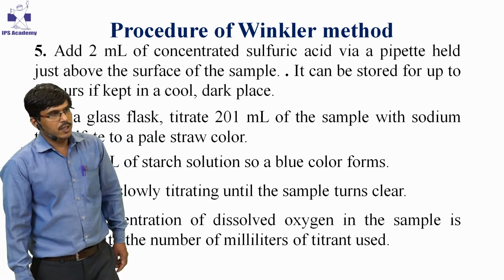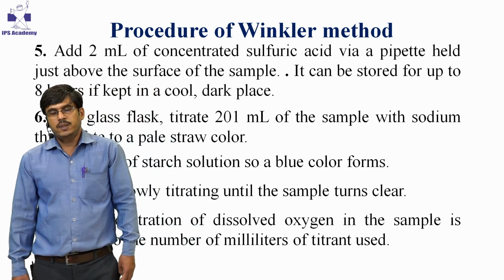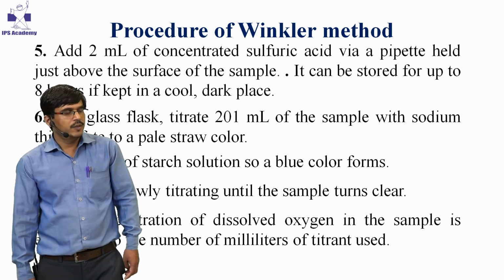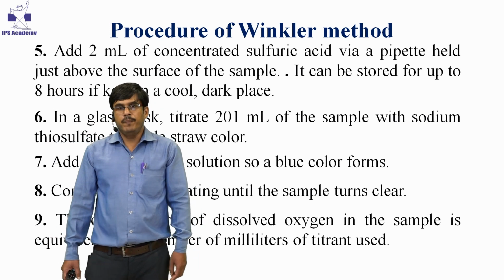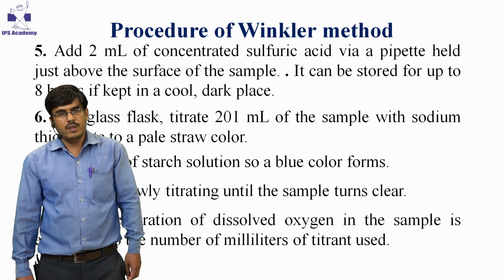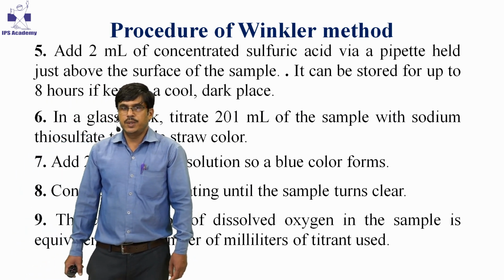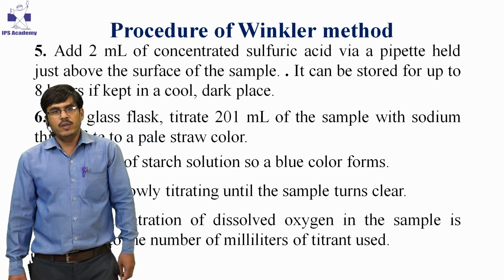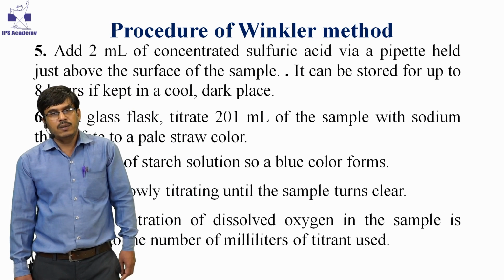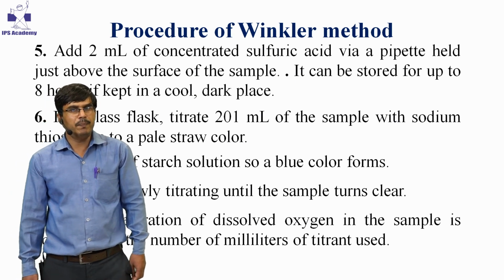That is, if 5 ml hypo is used in the reaction, that will give the result 5 ppm dissolved oxygen. It means the volume of hypo used in the reaction will give directly the amount of dissolved oxygen in milligram per liter.